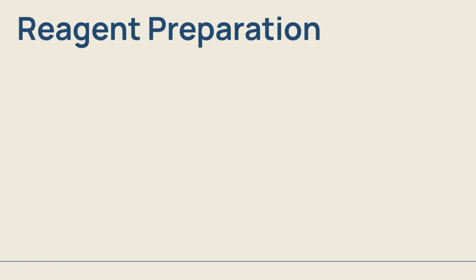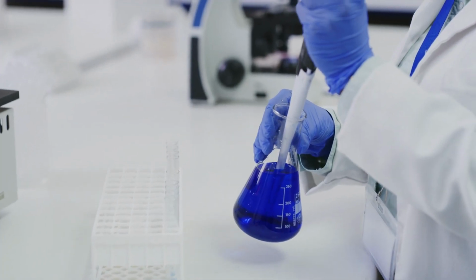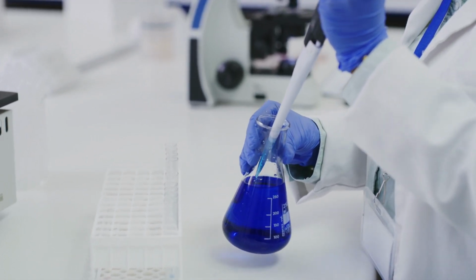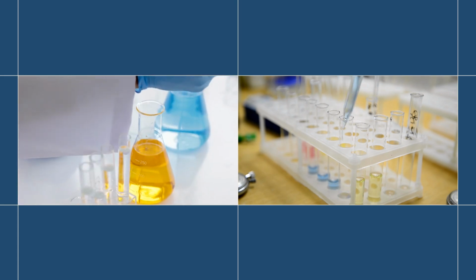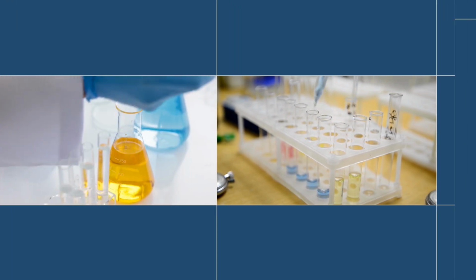Next, we move to the preparation of reagents and the standardization process required before sample analysis. The DTPA extractant, a solution of DTPA, TEA, and calcium chloride, must be precisely prepared. A crucial step is adjusting the pH to 7.3 using dilute HCl just before making up the final volume. Standardization is achieved by calibrating the AAS instrument with 4 standard solutions for each element: iron, manganese, zinc, and copper, and plotting the calibration curve.